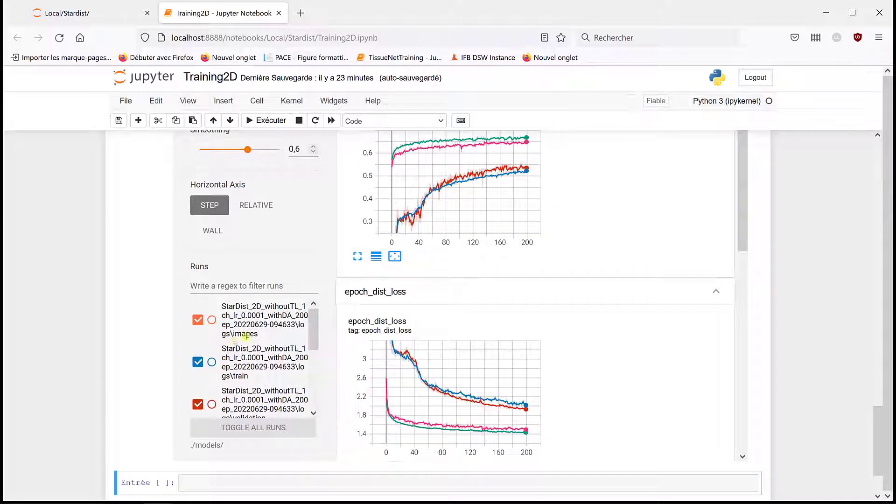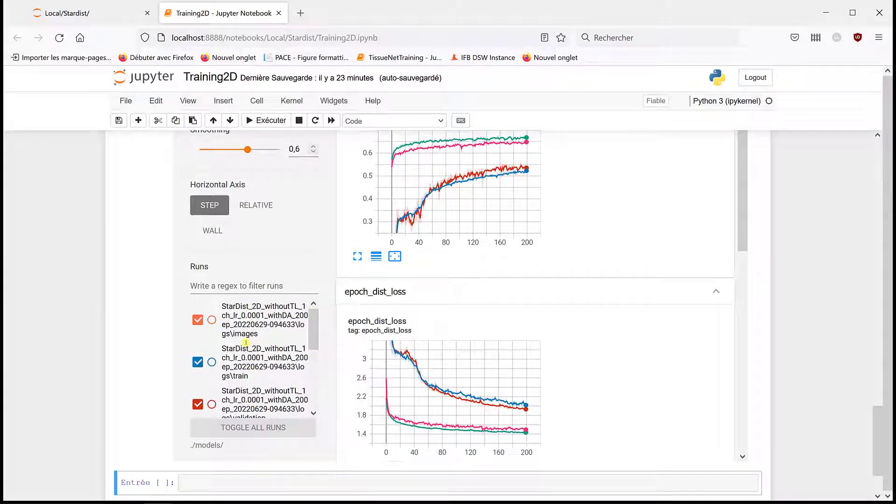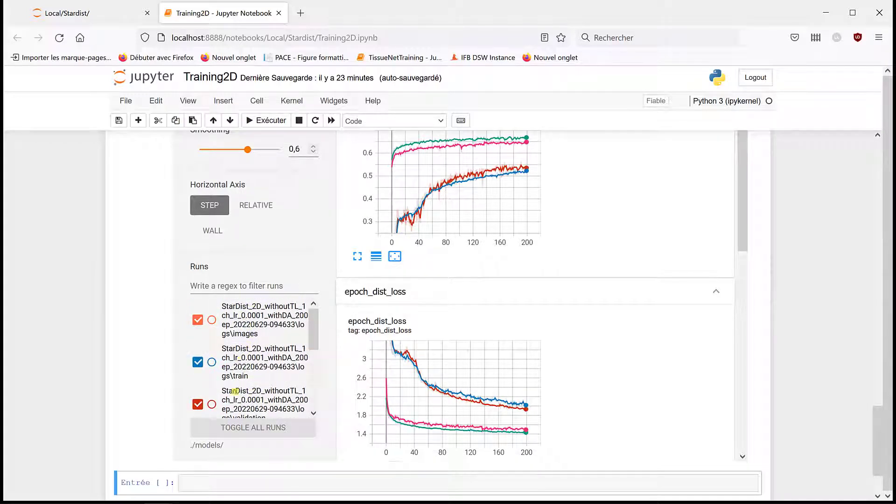Corresponding to the result we've got. Sorry, blue and green. Blue, so it's without transfer learning.